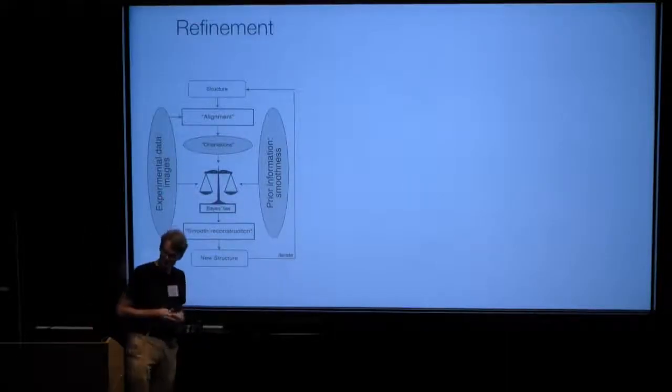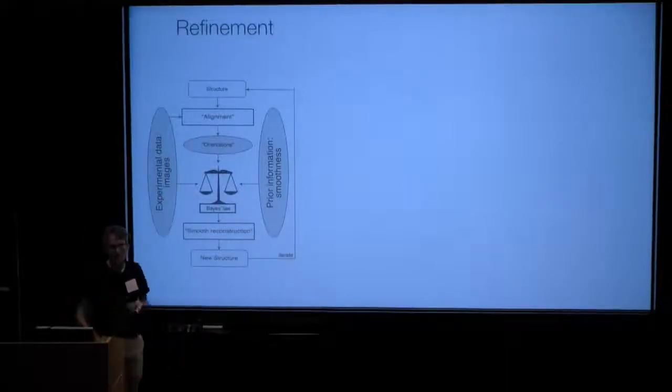The traditional way would be to just refine and iterate over one structure, and there have been several speakers that have brought up how we do this. But the point is that basically we need to optimize the orientations and alignments of molecules.